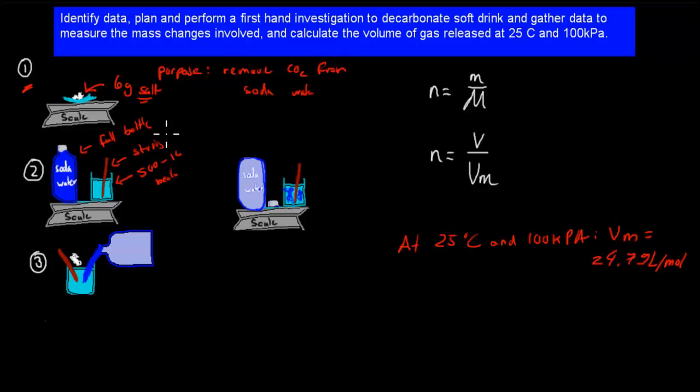So far we've just weighed salt, we weighed out 6 grams of salt, and we weighed out a stirring rod, a full bottle of soda water or a soft drink, and a 500 ml beaker. And we noted all that down, so we note all those masses down.